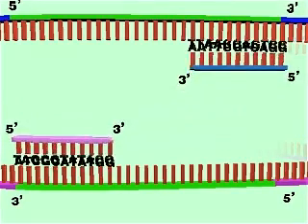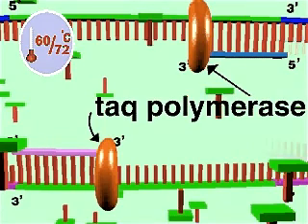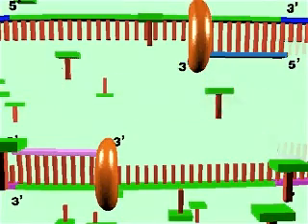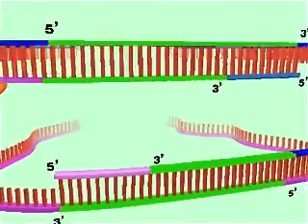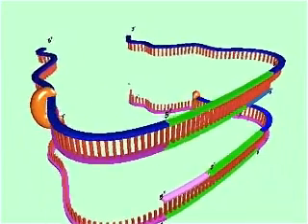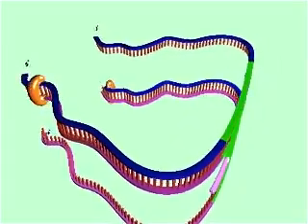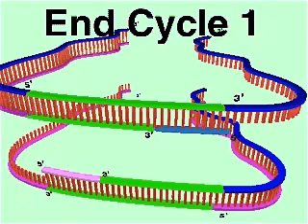The primers then direct a DNA polymerase, called Taq, to synthesize the complementary DNA strands from free nucleotides. In the entire mixture of genomic DNA molecules, only DNA containing the target sequence is copied because the Taq polymerase can only copy molecules that have a primer attached. At the end of cycle 1, both strands of the genomic DNA molecule have been copied to form two partially double-stranded DNA molecules.